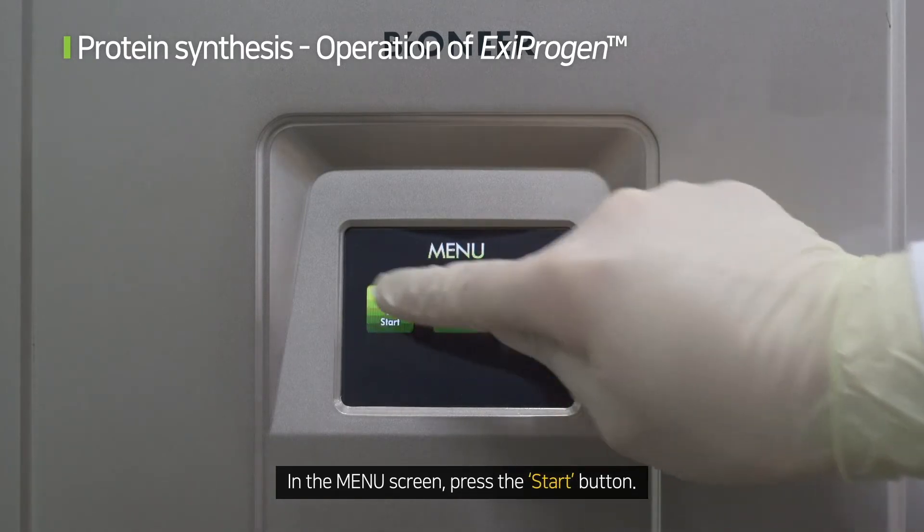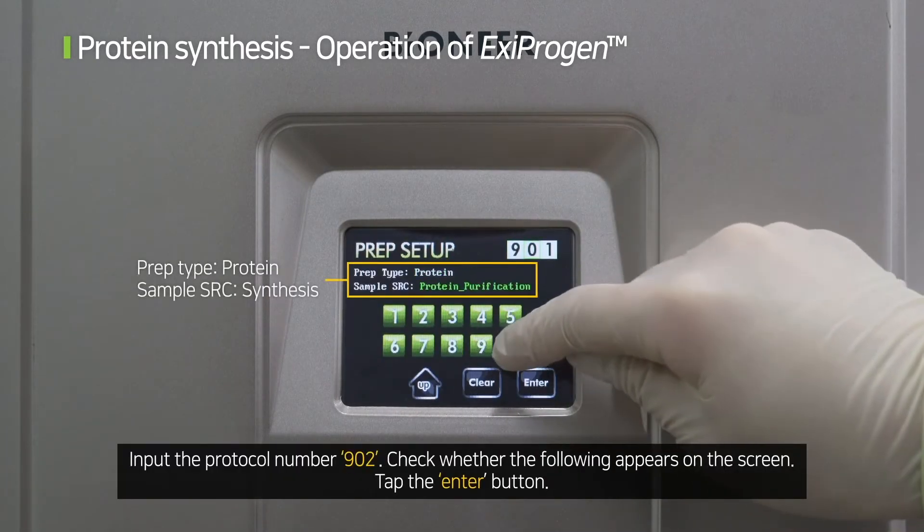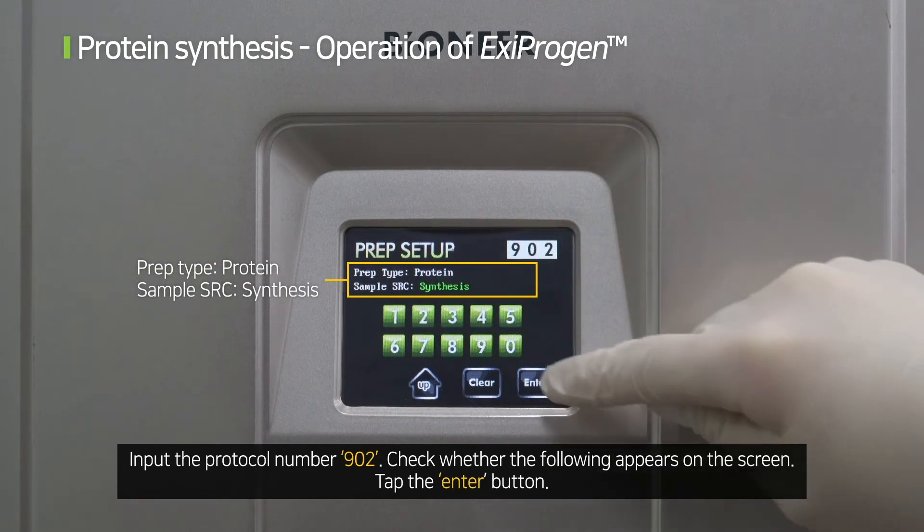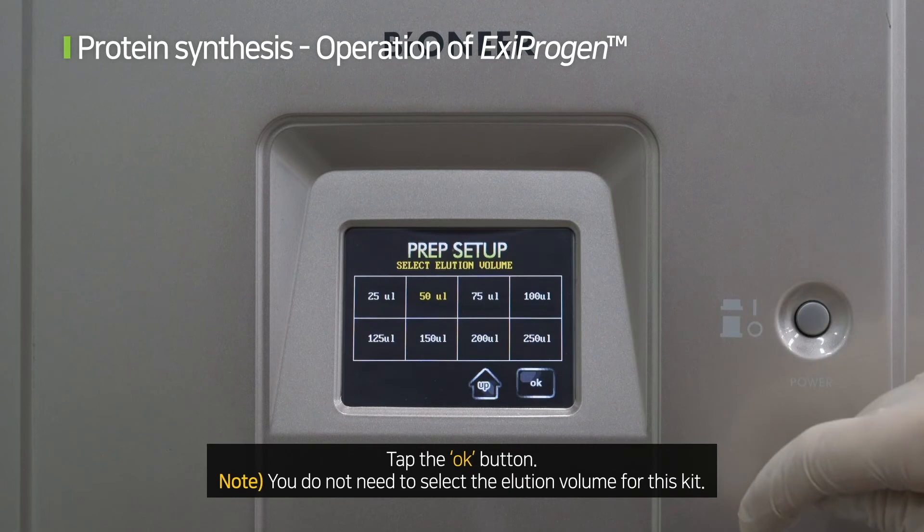In the menu screen, press the start button. Input the protocol number 902. Check whether the following appears on the screen, then tap the enter button and tap the OK button.